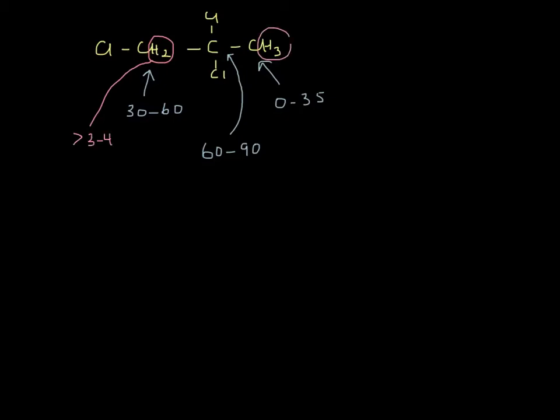Alright, likewise, these hydrogens over here, they're a CH3, and they're not attached. That carbon's not attached to any halogens, but these Cls over here will have a small effect. They might pull it up by maybe half each. So I would expect that guy to show up, and maybe instead of 1 to 1.5, maybe 2 to 2.5 ppm. All right, and so notice that this is going to have 3 carbon environments because we have 3 carbons. 1, 2, 3. It's only going to have 2 hydrogen environments because we only have 2 hydrogens. All right, so let's pull up these 2 spectra and see how we did.